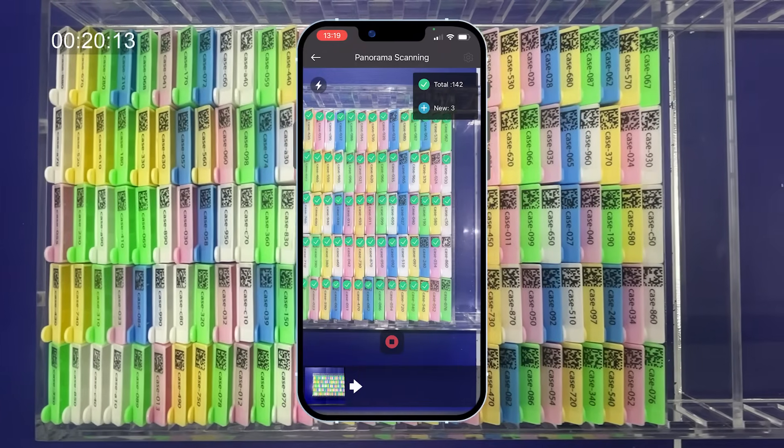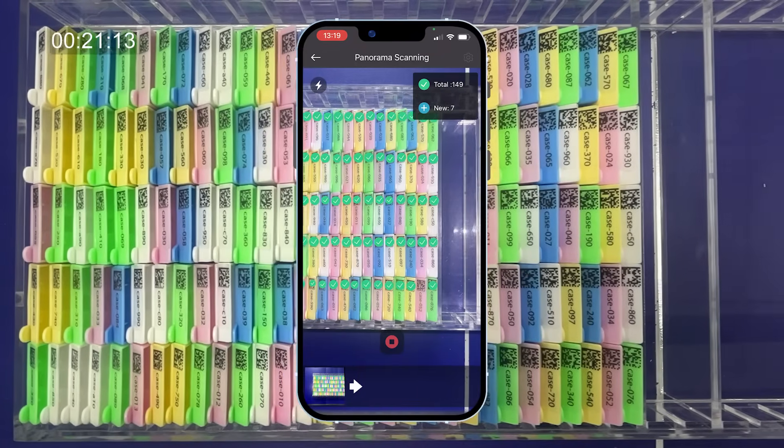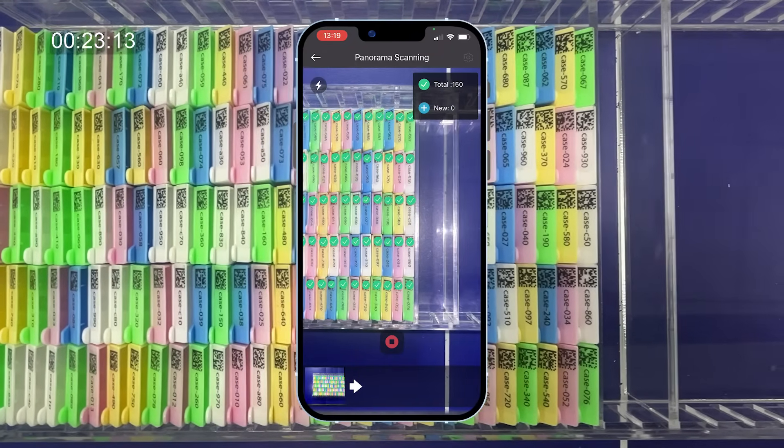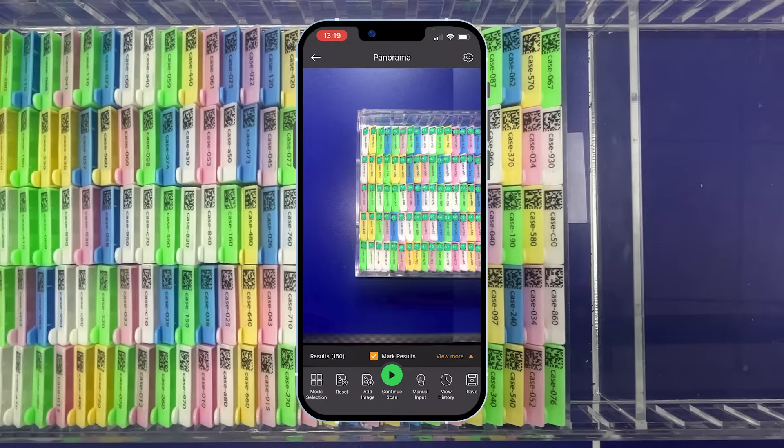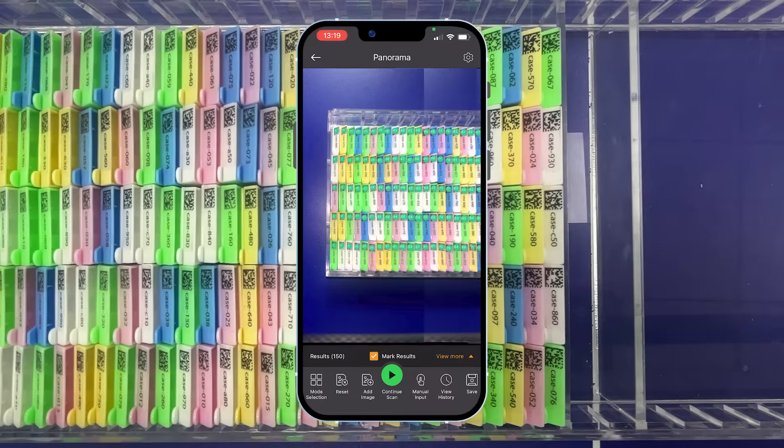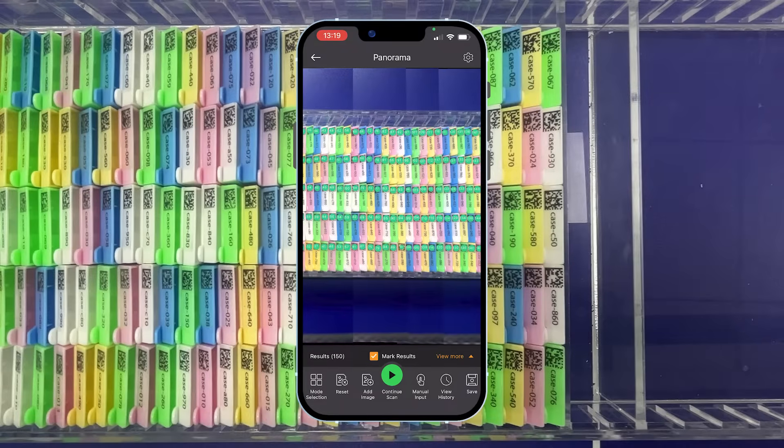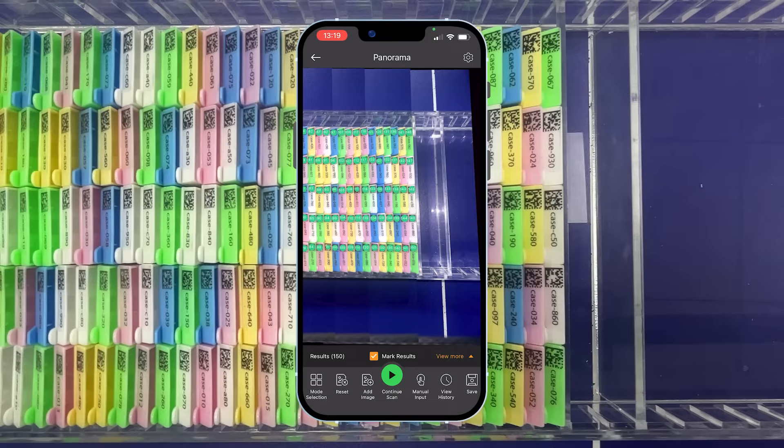To ensure accuracy, multiple analysis modes are used to localize every barcode. Once the count reaches 150, scanning stops automatically.